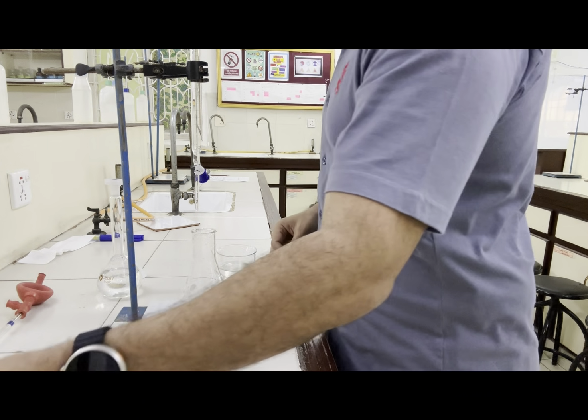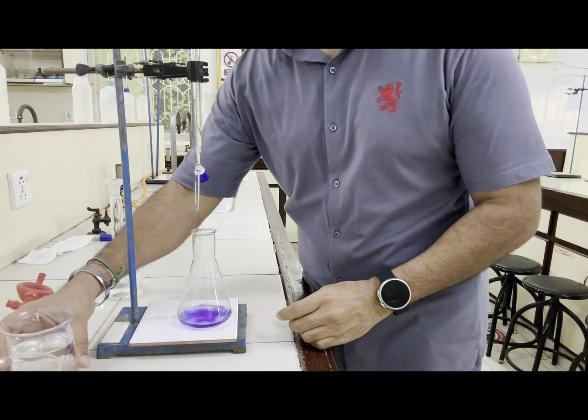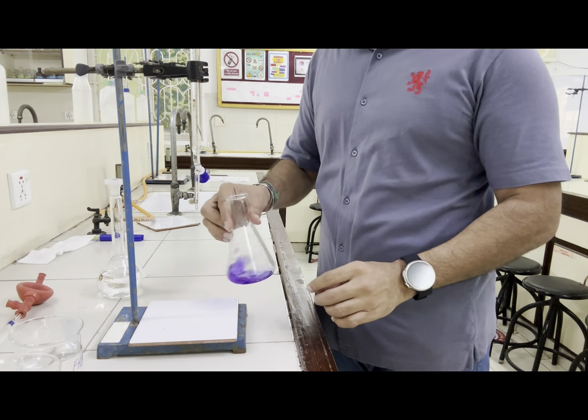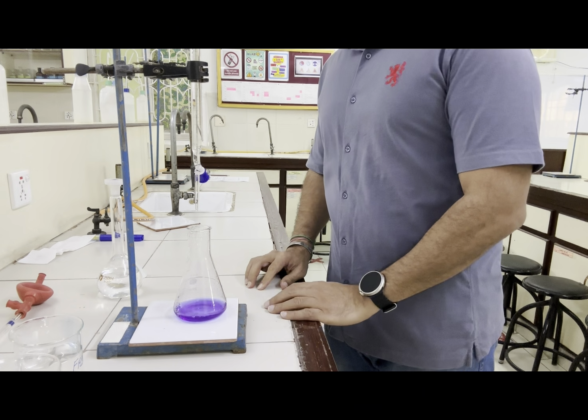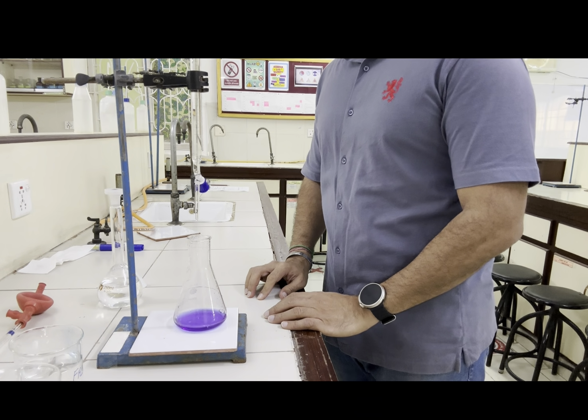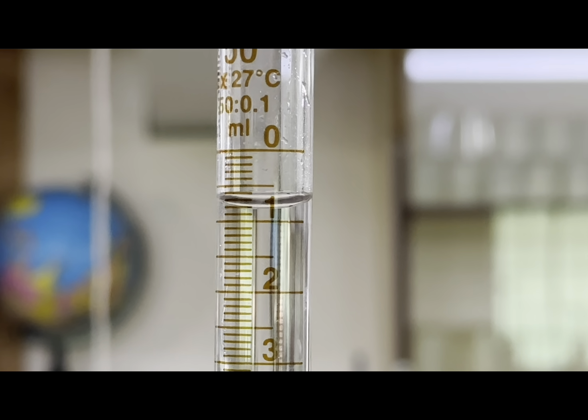Normally we add 3 drops, but whenever the question says this much to be added, then you have to add the same amount. Now let's record the initial Burette reading. This is our initial Burette reading, 0.80.